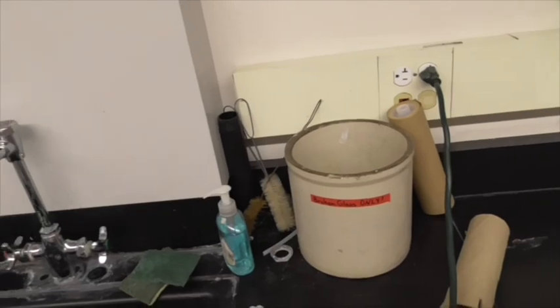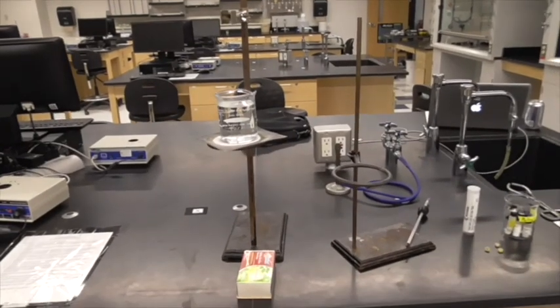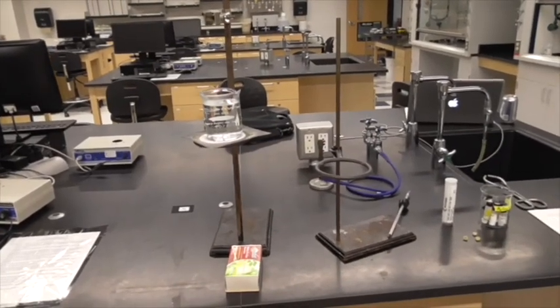All right, and that's about it. We're just going to let everything cool down, put it away, and be done with the melting point, freezing point lab.